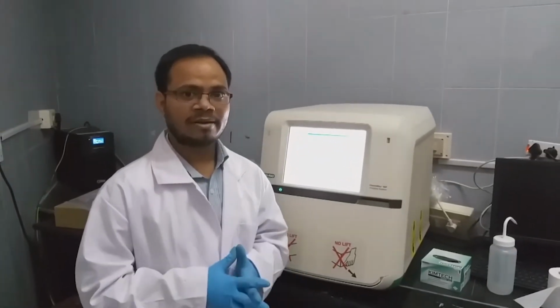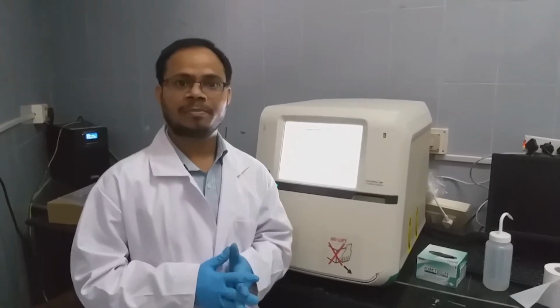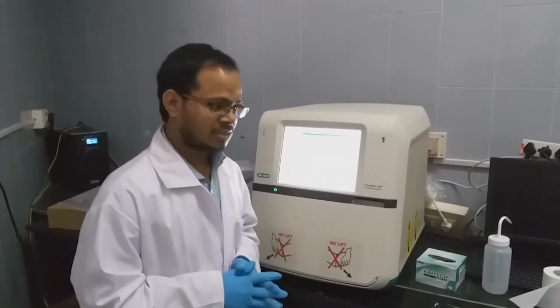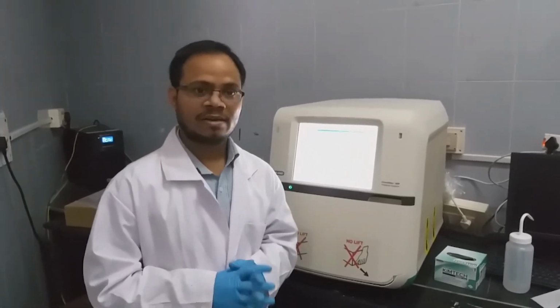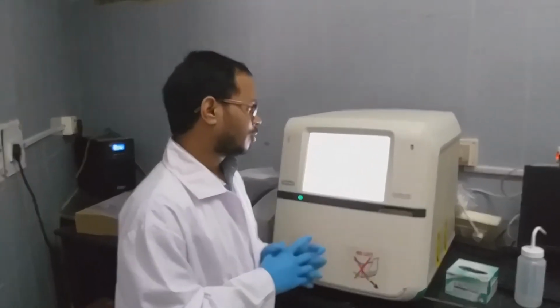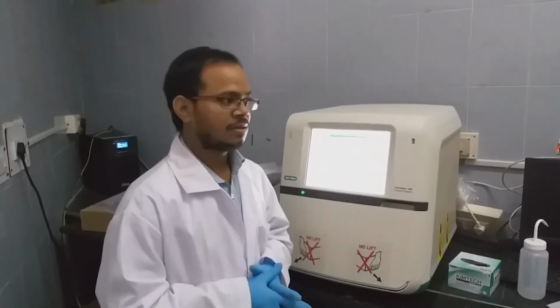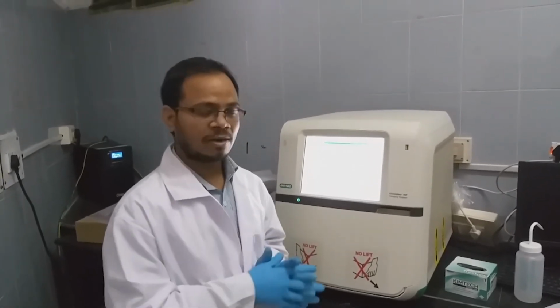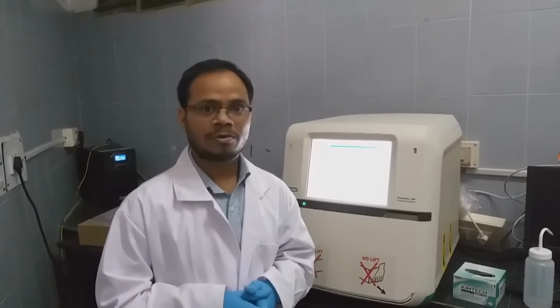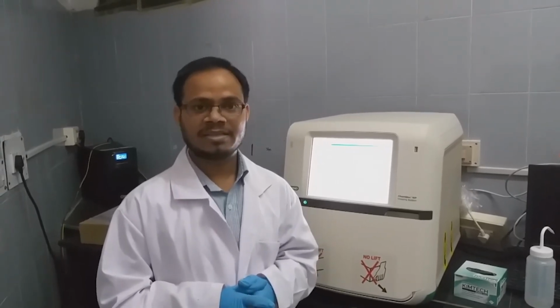software. In this video, we have learned how to prepare an SDS page gel and how to run it, what precautions need to be taken while preparing the gel, and how to record the gel using a gel documentation system. I hope this will give you a gist of how to prepare and run an SDS page gel and analyze the protein sample.